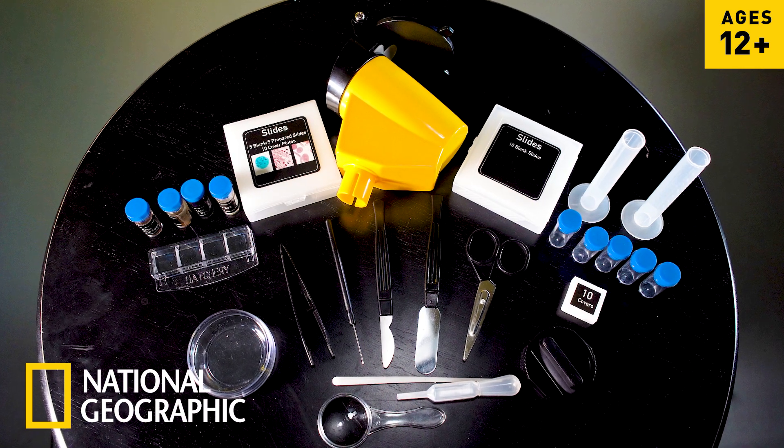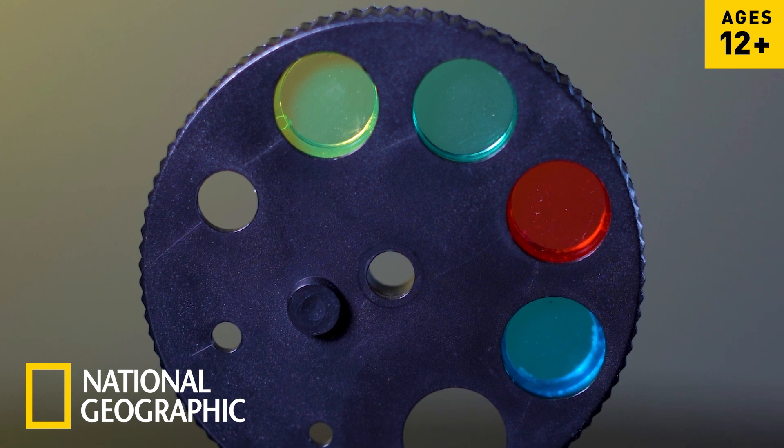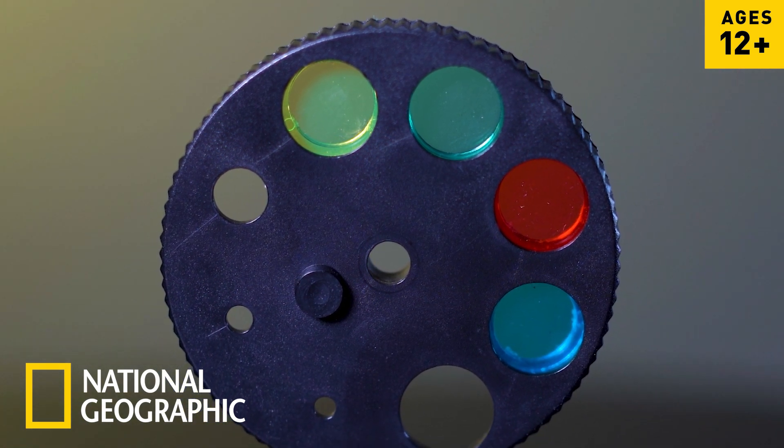Jumpstart your investigations with the included bounty of collection tools and use the included color filters in combination with the LED light to enhance specimens that need extra definition.